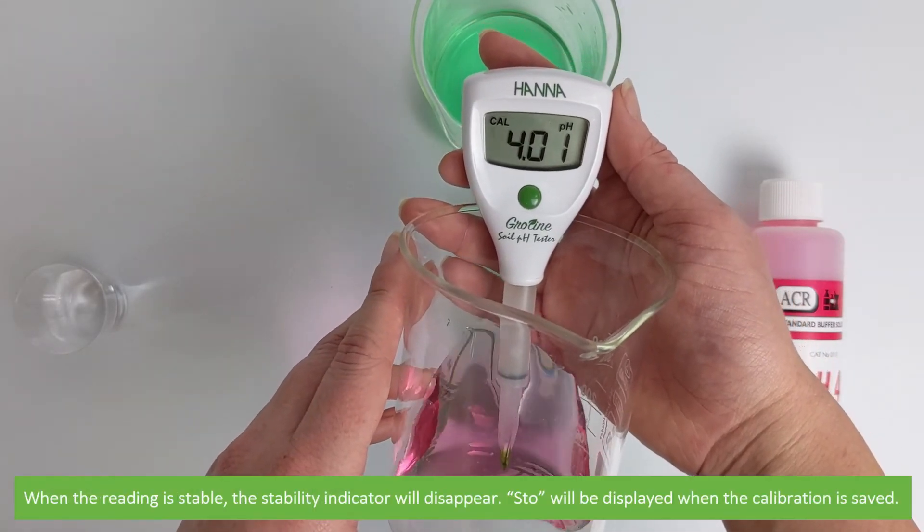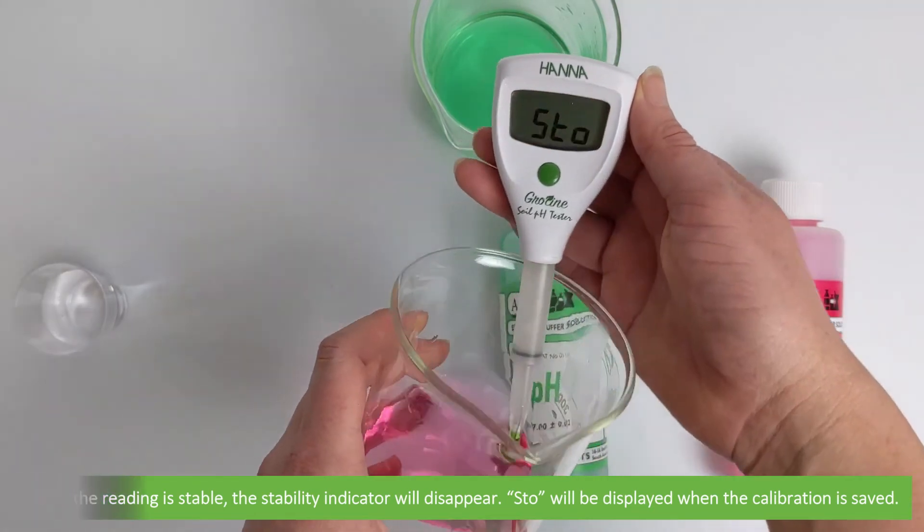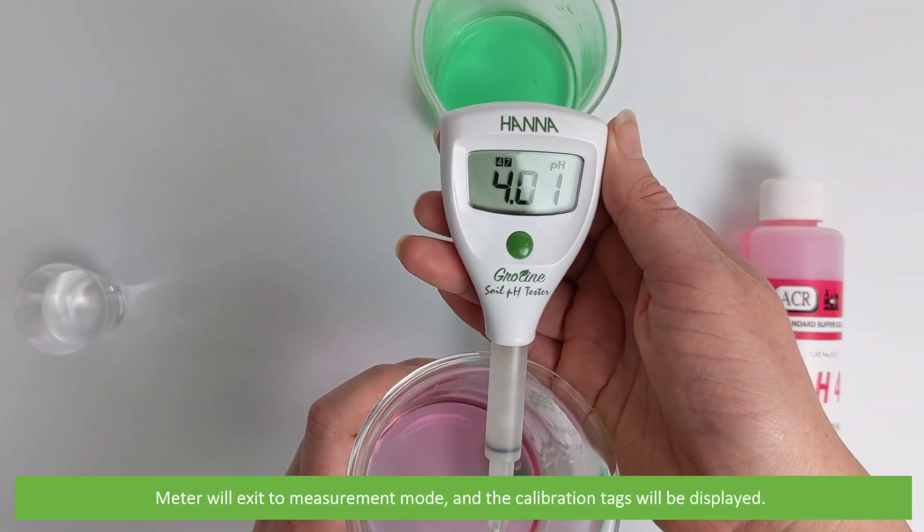When the reading is stable the stability indicator will disappear, STO will be displayed and the calibration will be saved. The meter will automatically exit into measurement mode.